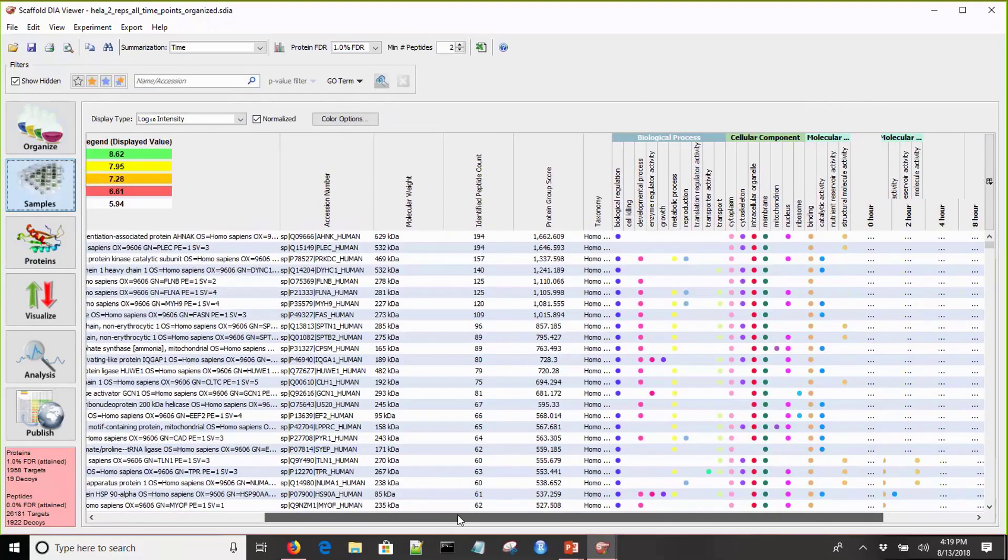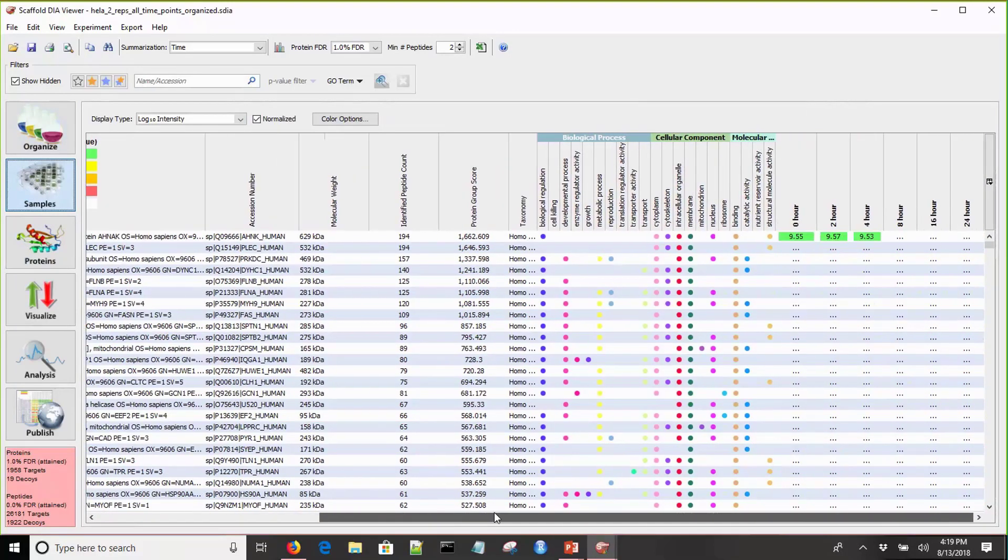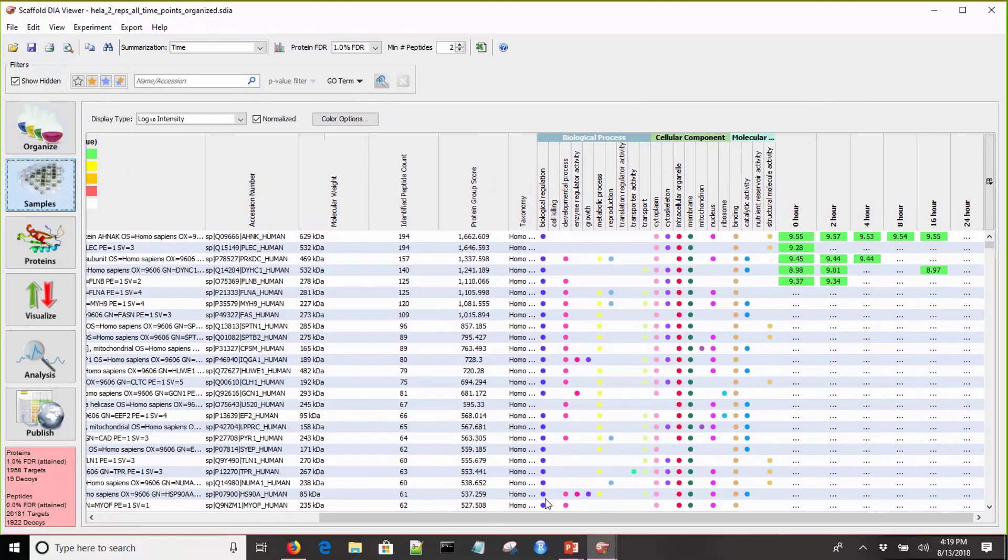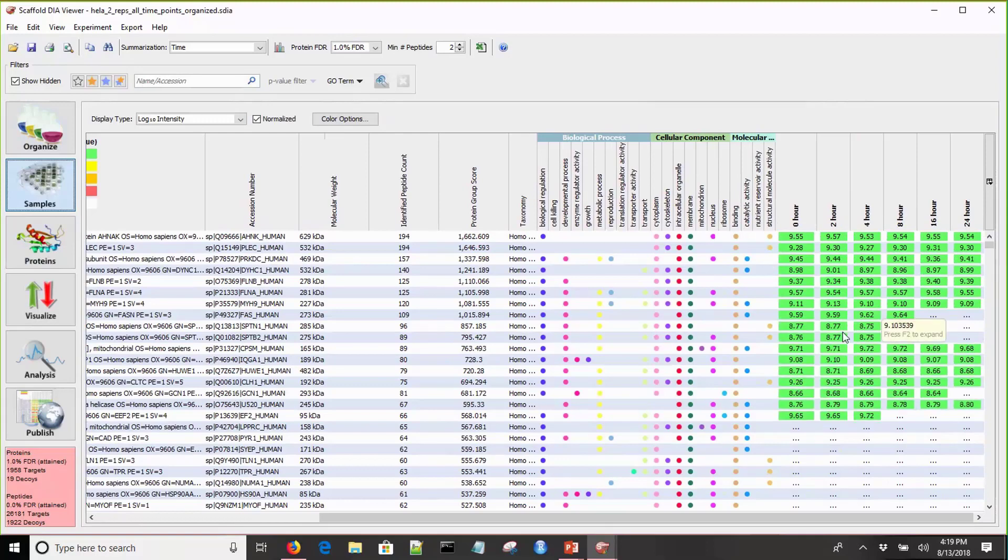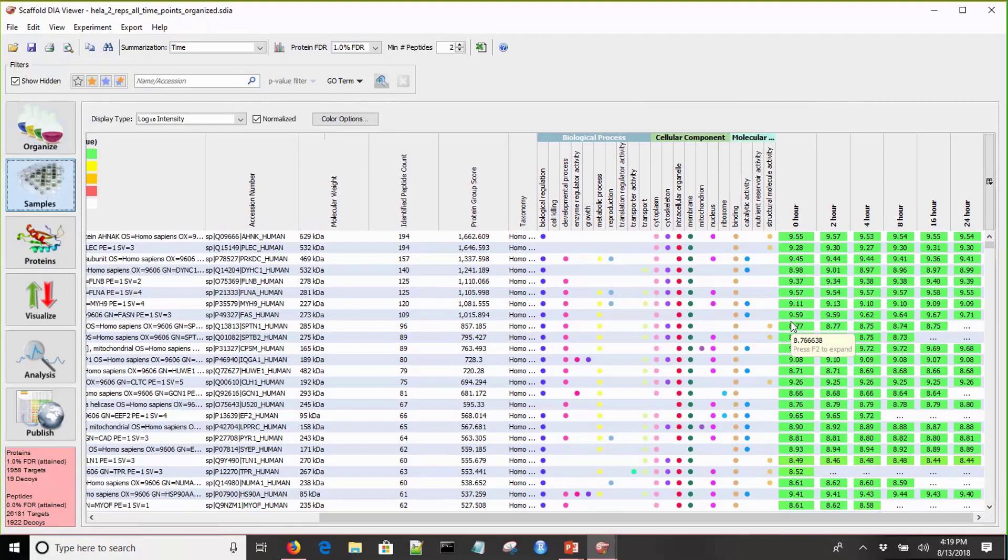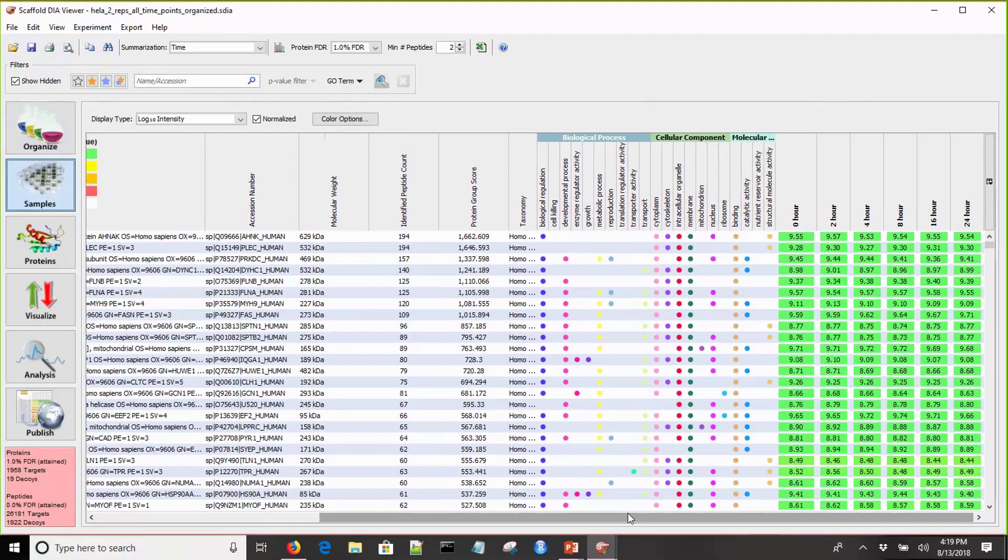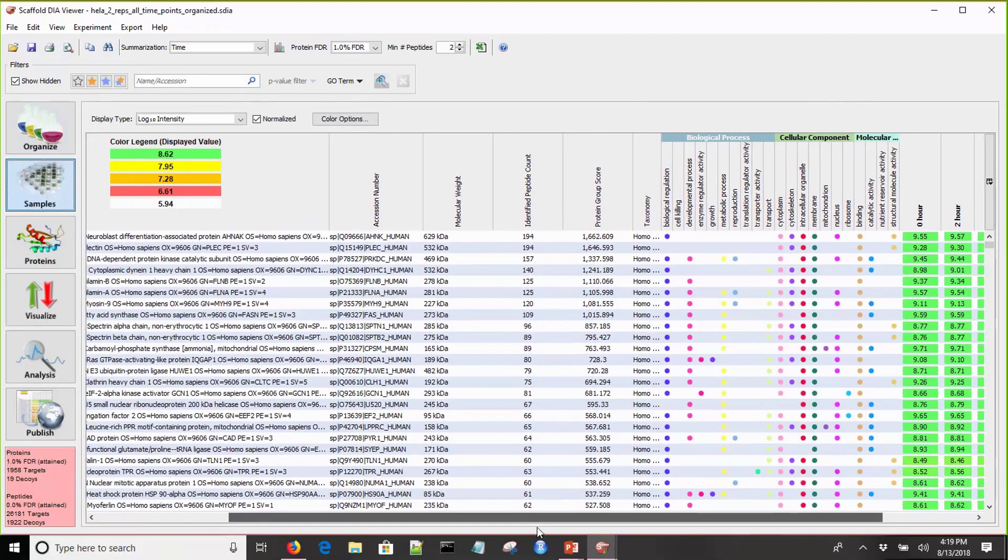Let's go back to the samples view. If I move over to this side, we'll see all of our different levels here. We have 0 hour, 2 hour, all the way through 24 hour, and all of our quantitative values are rolled up to the proper attribute group level.